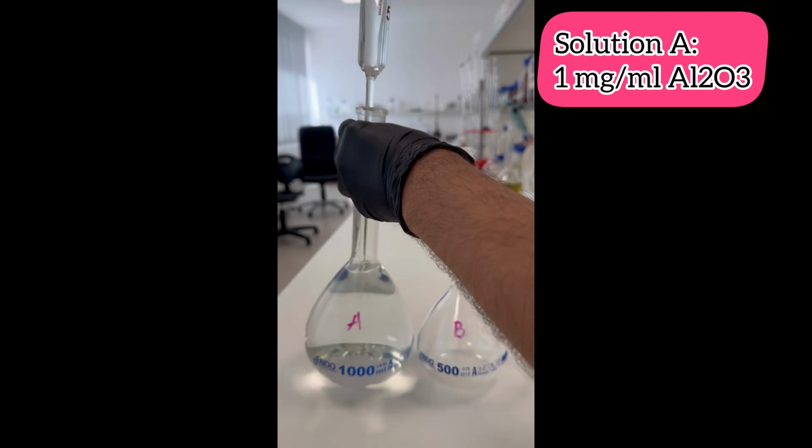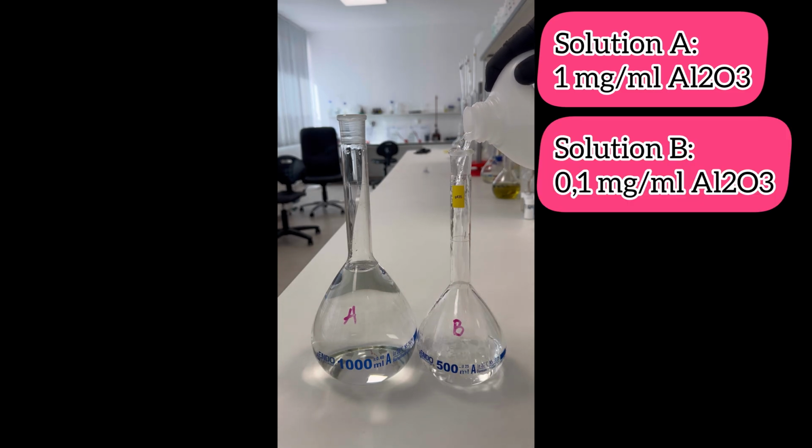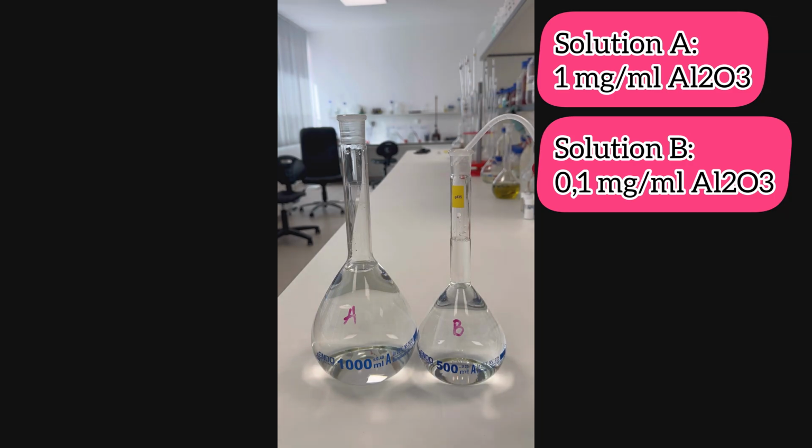A 50 milliliter portion of solution A is transferred to a 500 milliliter volumetric flask and diluted with distilled water. This is solution B, and its concentration is 0.1 milligram per milliliter.